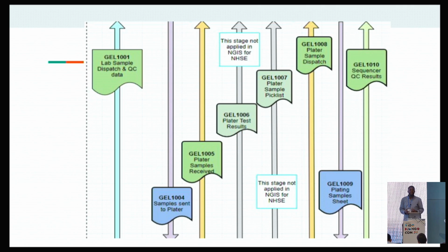So every 15 minutes past the hour, it checks if there is any new CSV file that has been stored. So that's how we send our gel 1005 message. So it's been automated, that runs every hour.